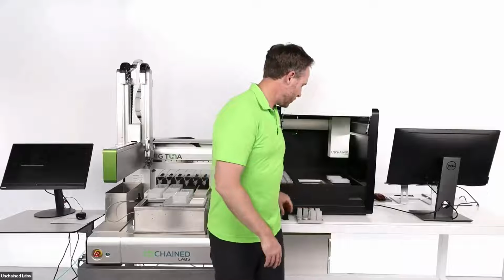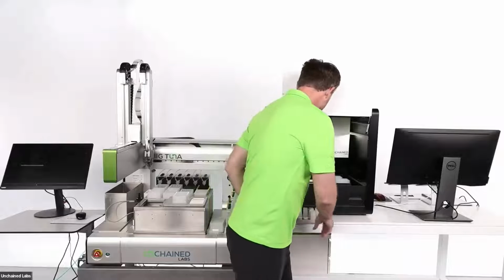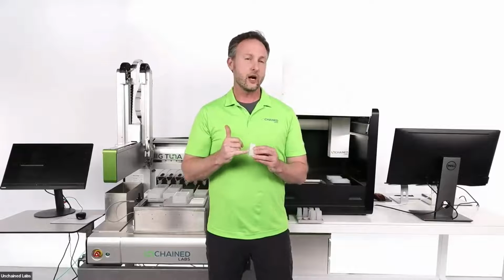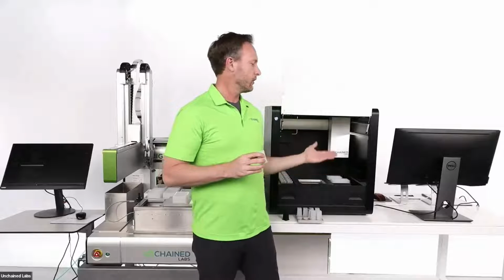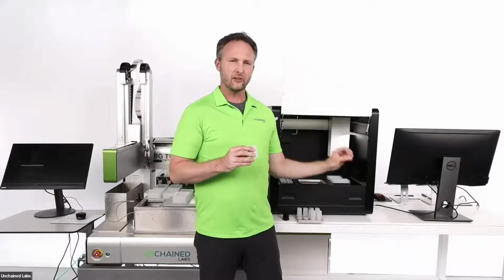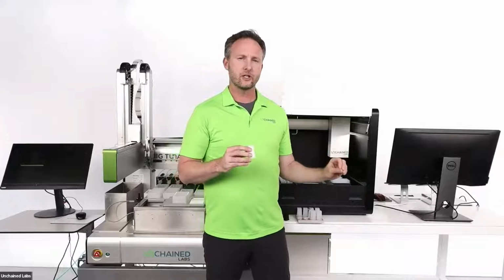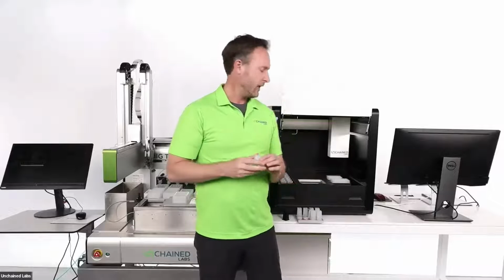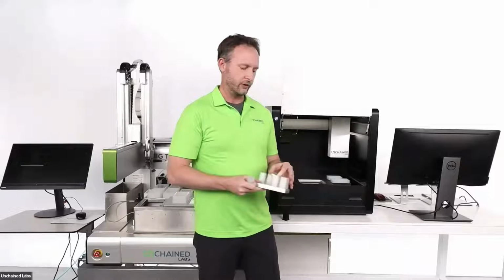But first, I'd like to switch over to the Una, which is the consumable for the Unagi platform. Unagi is really the benchtop buffer exchange solution. So it still has that same cool core technology piece. It just has a lower capacity. And what is that capacity? Well, you can run from 1 to 8 Unas, as you see here in the sample rack.